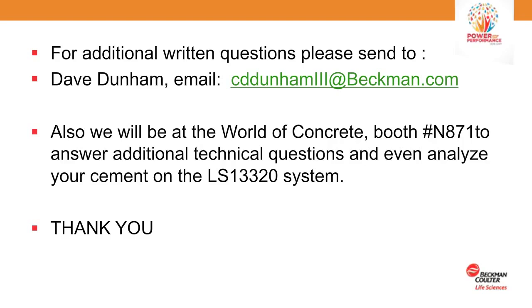Our next question, McGill asks, what is the life of the sensor? Typically, these are solid-state lasers, so depending on its use, if you're operational 24 hours a day, you're probably talking 8 to 10 years. And if you're going to be running just one or two shifts, that could be somewhat longer. I usually don't see or hear about lasers being replaced until maybe 12 years out, 14 years out. So that's great. It lasts a long time.